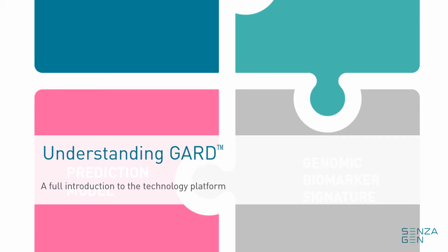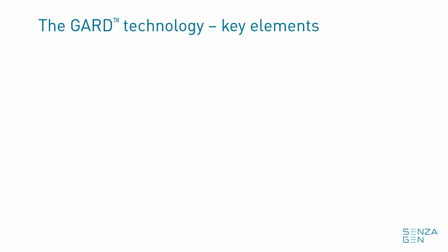Understanding the GARD assay, a full introduction to the technology platform. GARD stands for Genomic Allergen Rapid Detection. The development of all GARD assays is based on the same principle, which includes four key elements.